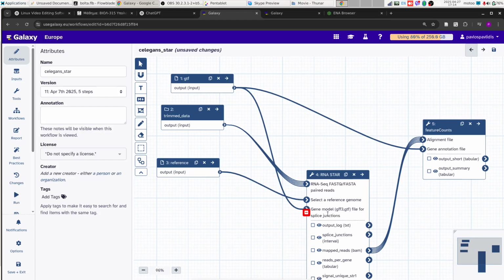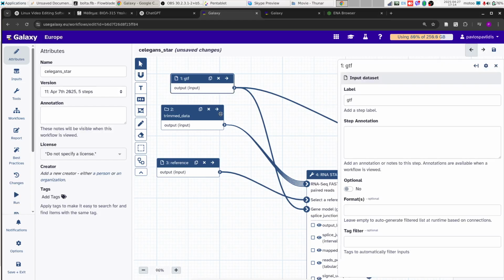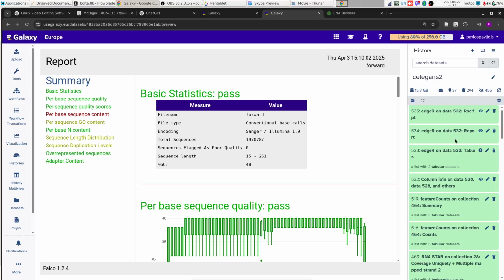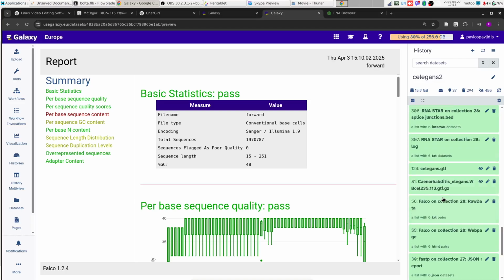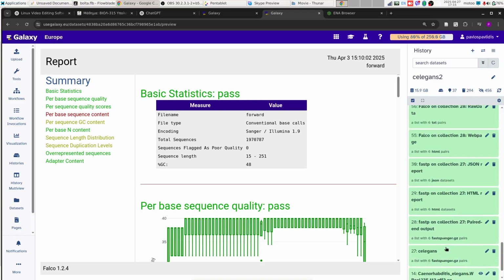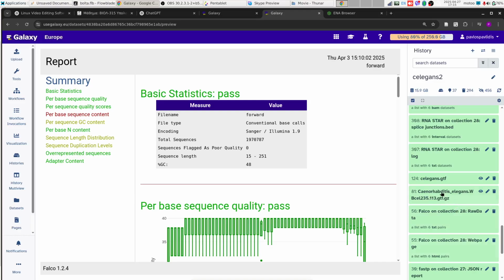We will see this file, and we can start with this file actually, yeah. So this file, I have it somewhere here. So is this GTF? I need the GTF, not the GFF3. I must have saved it somewhere here.